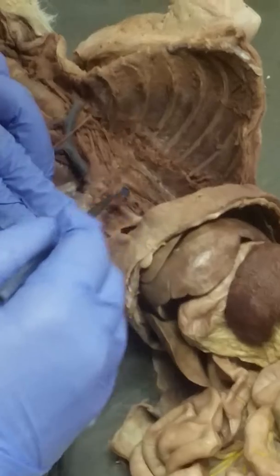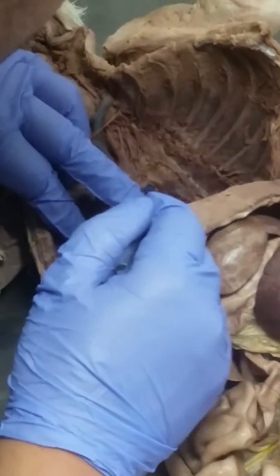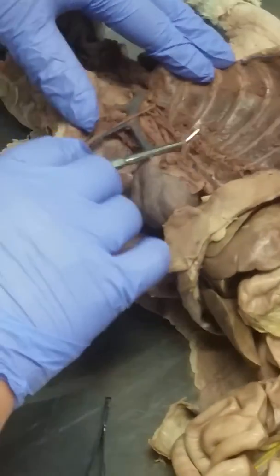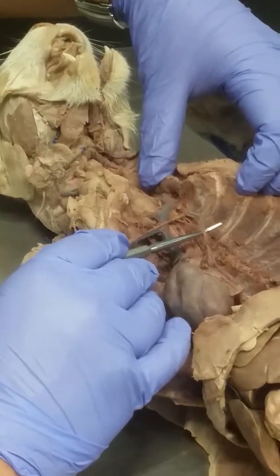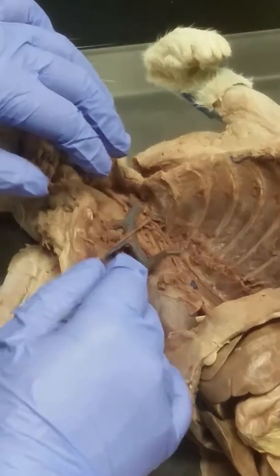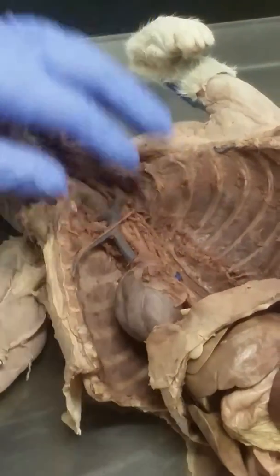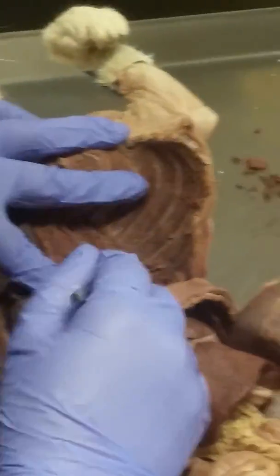Now, since the vagus is coming down this way, you can still find the vagus nerve. See, here's my vagus nerve now. And if I tug on it, it's going to tug right here. So the vagus is going to come down like that. So that's the right vagus. Left vagus.